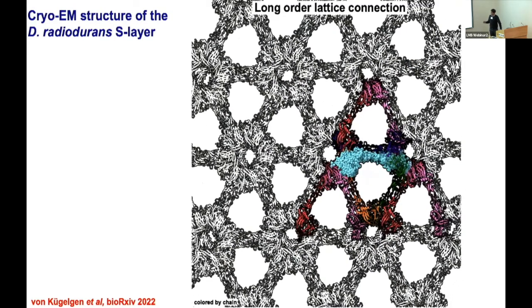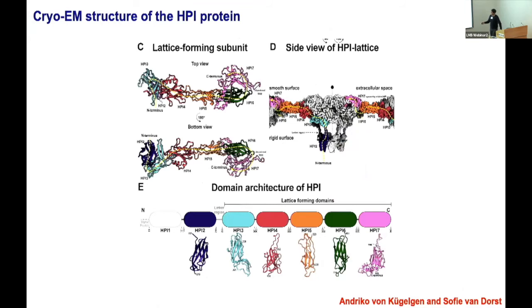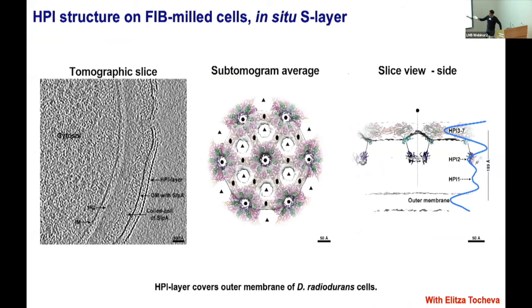Why am I showing you this? Because this is also biologically relevant: this bacterium is actually a diderm bacterium, meaning that even though it stains gram-positive, it's like a gram-negative bacterium. It has these immunoglobulin-like domains. And I put this in there, sorry, because this is biophysics. To confirm that this protein is actually making up the S-layer, we did focused ion beam milling of these cells and performed subtomogram averaging, because there was a bit of a debate in the literature.